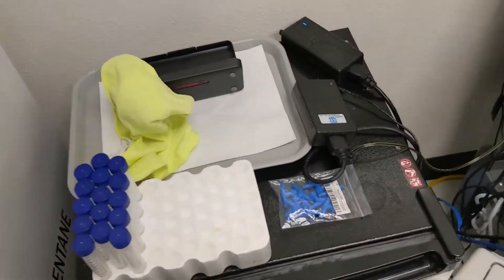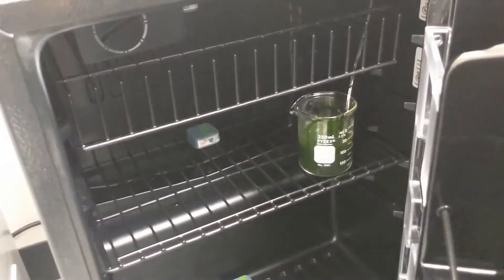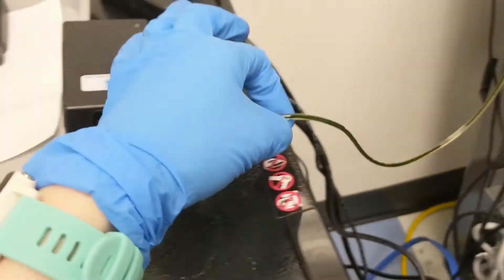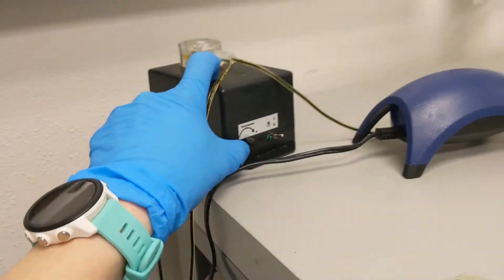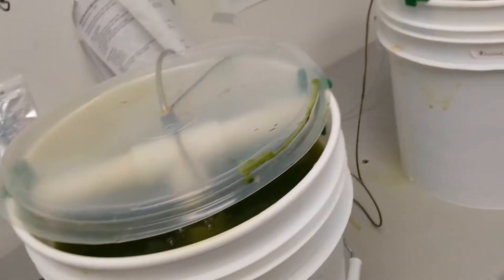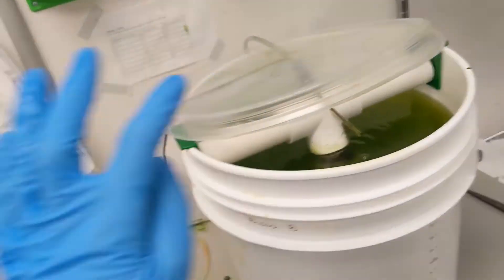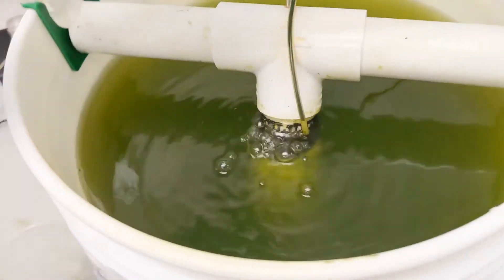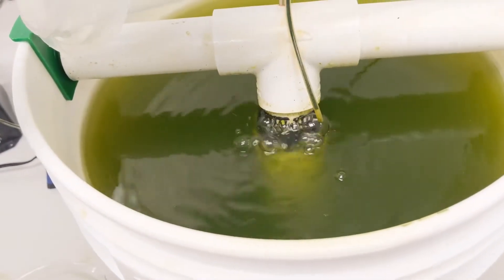Here's our rotifer setup. We have a small mini fridge kept at four degrees Celsius with our algae in it, which has a peristaltic pump attached to it that pumps algae to rotifer buckets every couple of hours. These rotifer buckets are five gallon buckets with an air stone on the inside to keep them aerated, as well as filter floss to catch any debris.